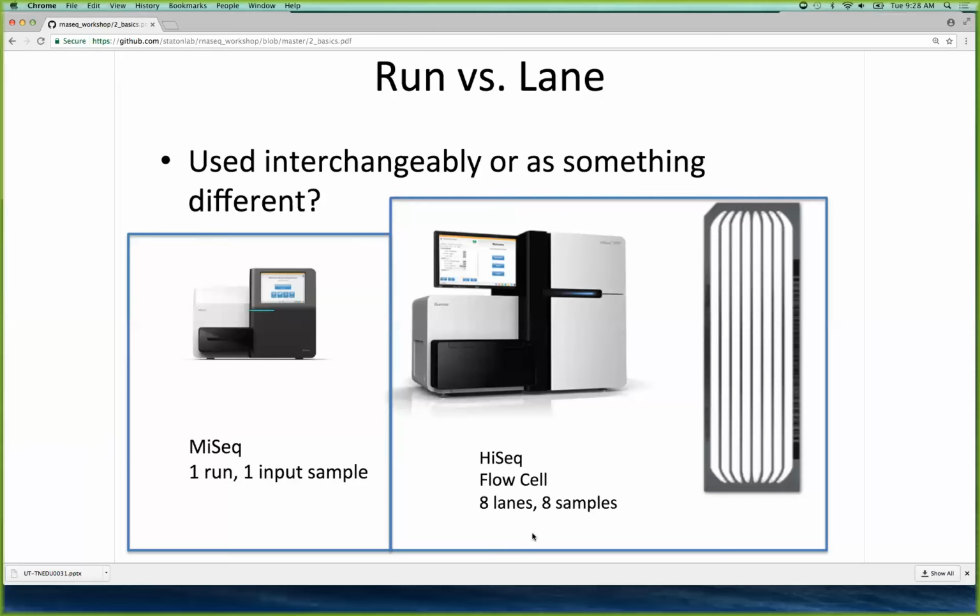So the RNA-seq library preps, for those of you who haven't ordered your RNA yet, these prices that I gave you earlier, the $2,000 to $6,000, that's just to run the instrument. It's like $200 to $300 to actually do your library prep as well for each sample. So it gets really expensive really fast.